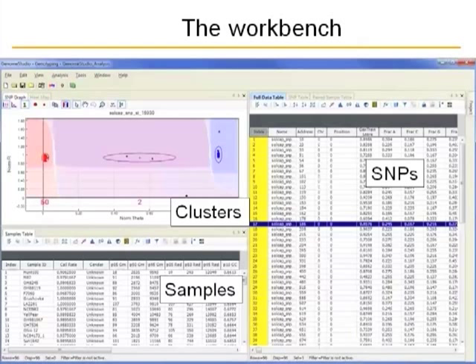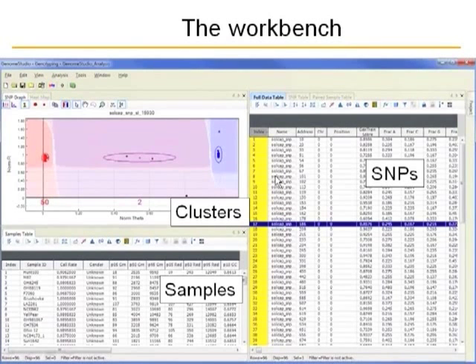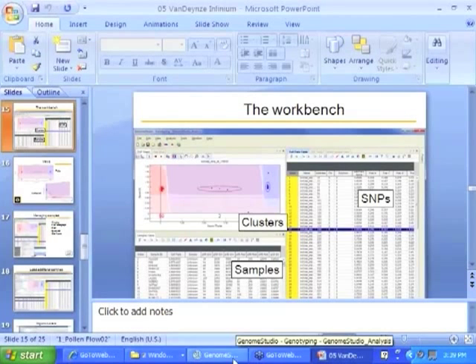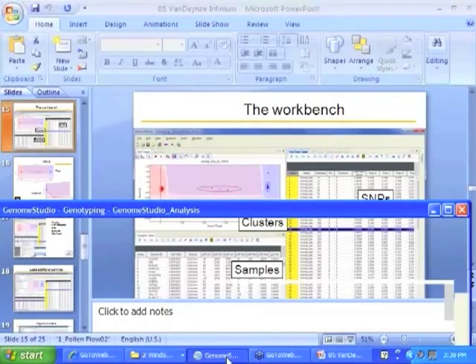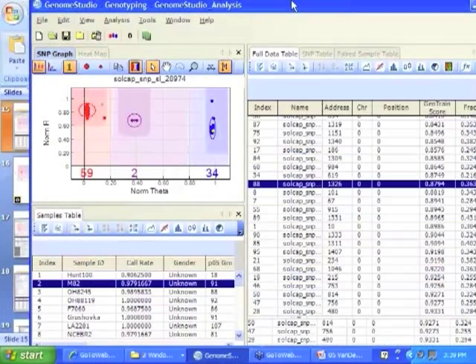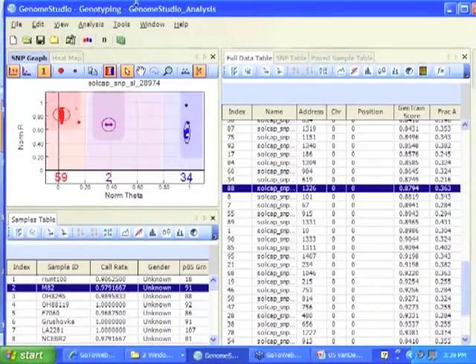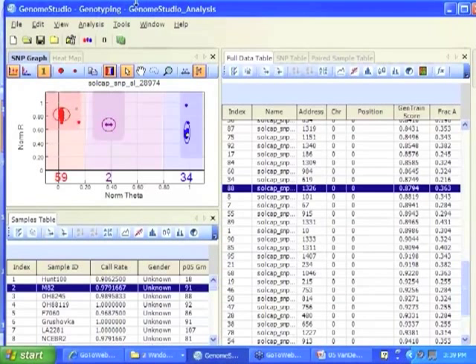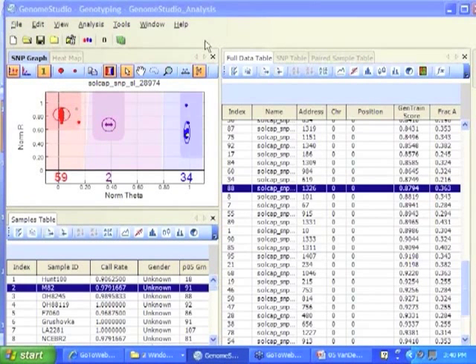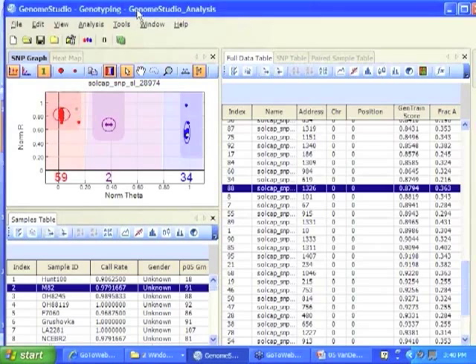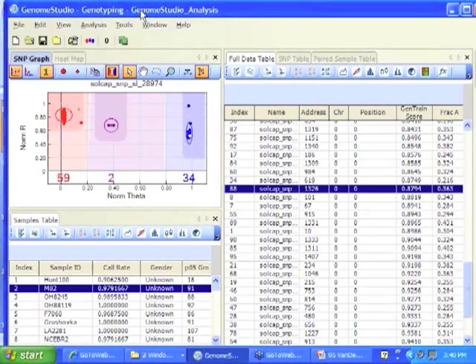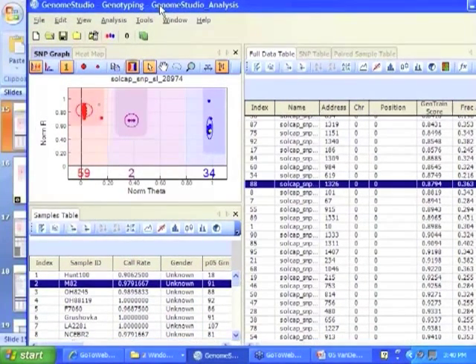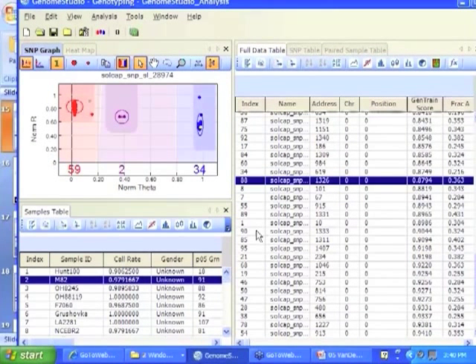Then you hit Next and actually let me go to Genome Studio now. And you get this, you get really five windows but you can just close them and you get three windows and it's called your workbench.